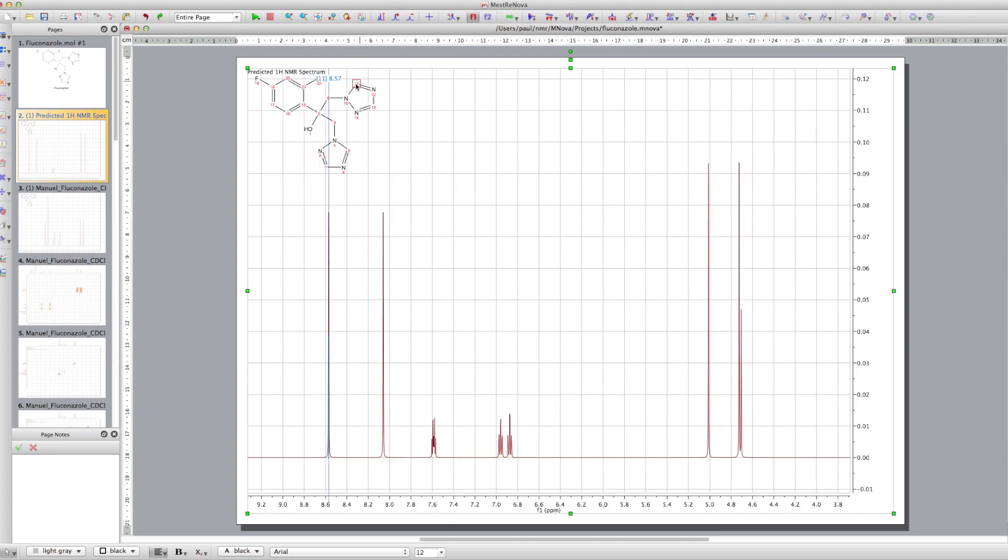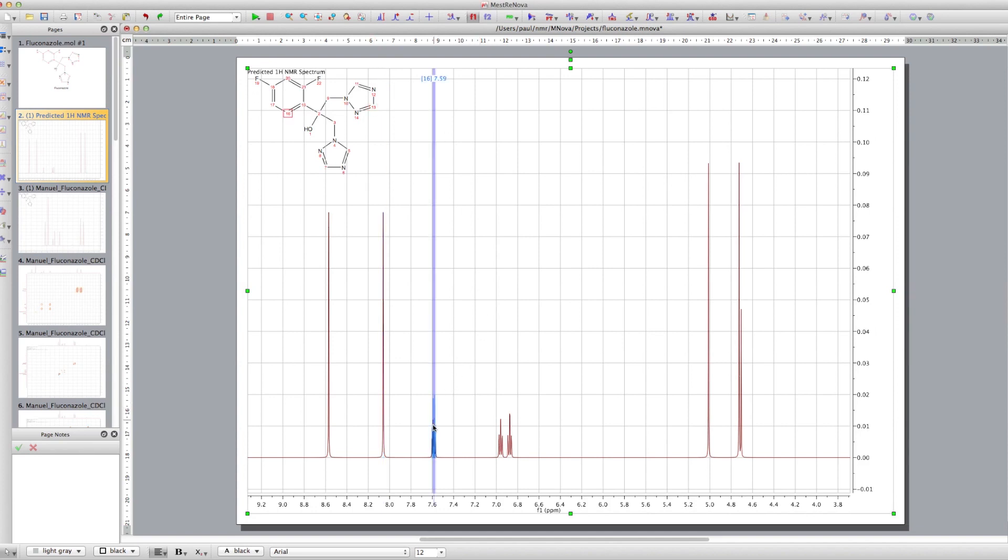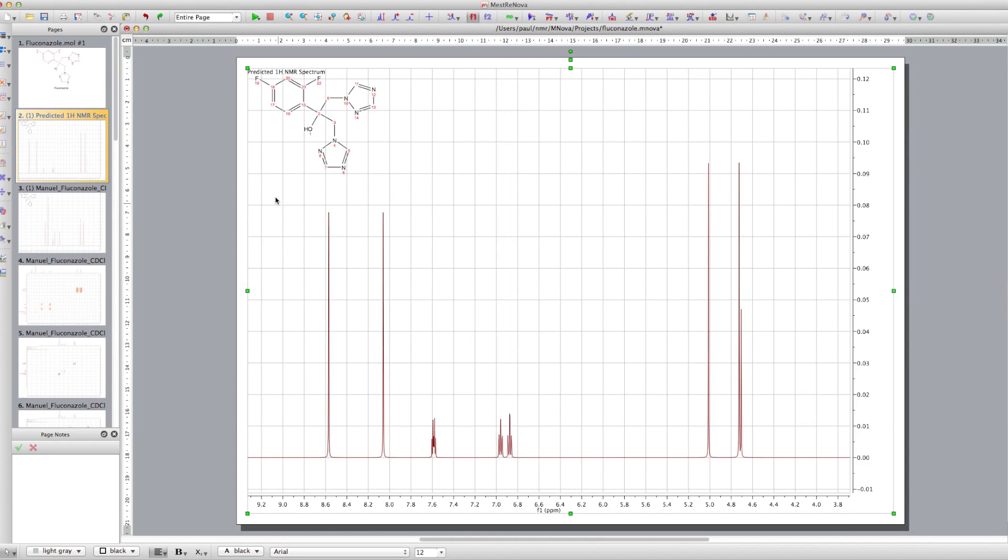The interesting bits are the heterocycles. So we've got the two protons that are stuck on the heterocycles there. We've also got the aromatic ring here, the benzene ring.